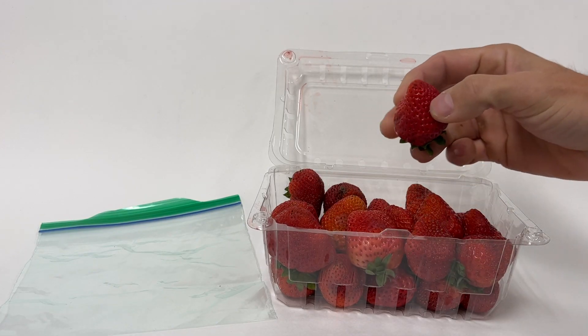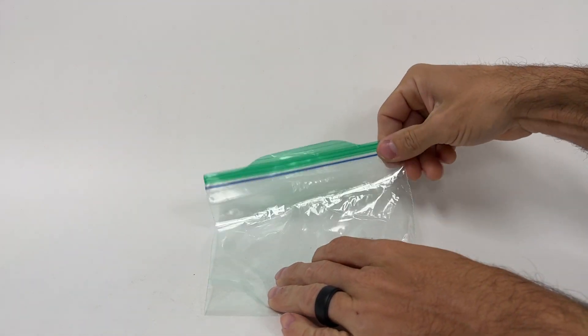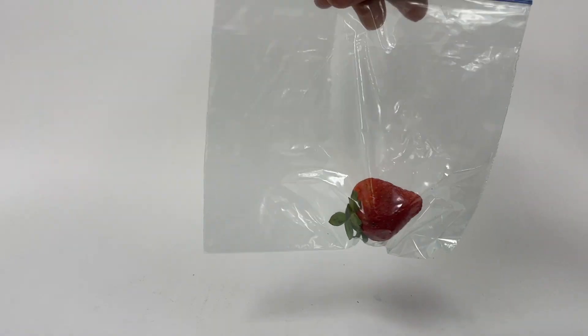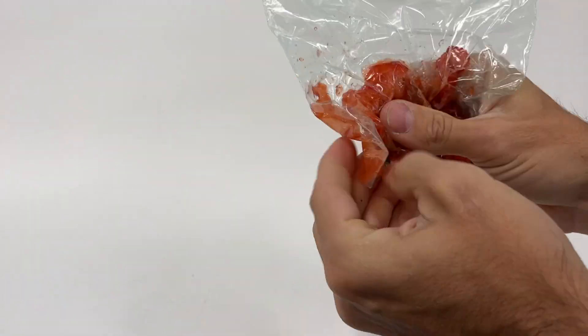After that, get a strawberry, place it in your ziplock bag, and try to get as much air out as possible before closing it. Then carefully mash up the strawberry for about a minute.